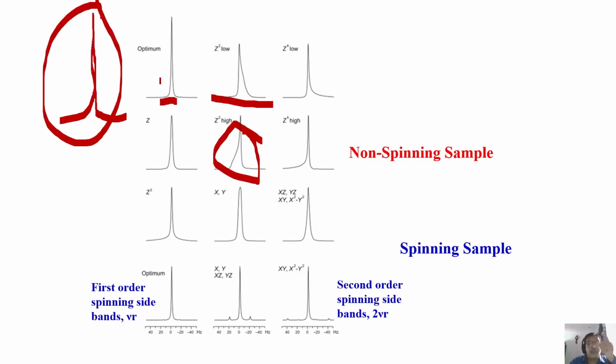And there is a way to test this. You have to test the full width at half height, and then also the width at 0.55% of the height of this peak, and 0.11% of the height of this one. So there is a reason for it. I will tell you later. So there is a way to find the line shape, whether it is good or bad.